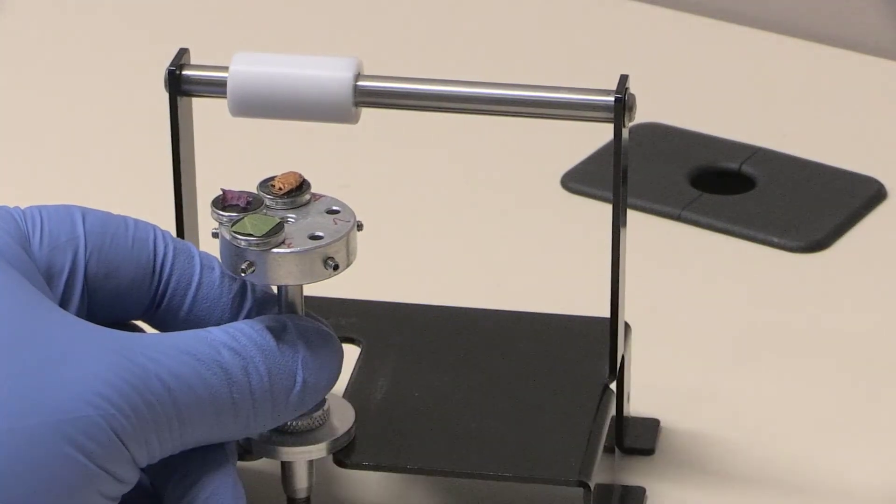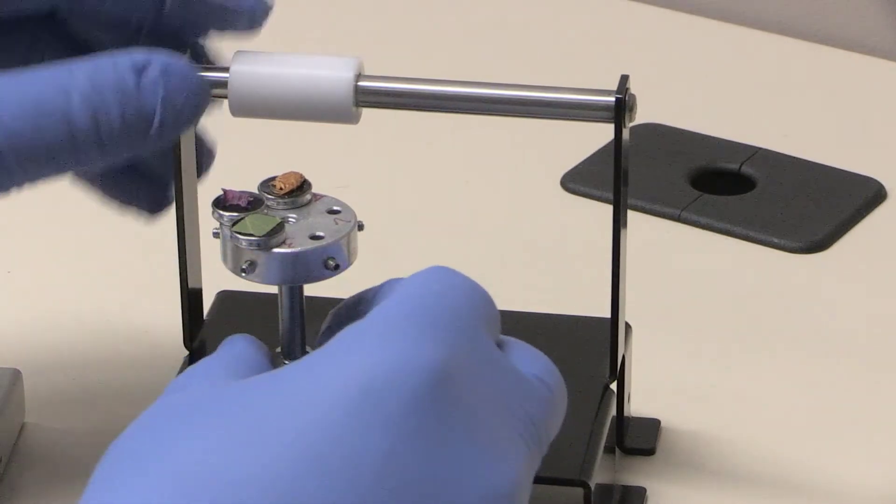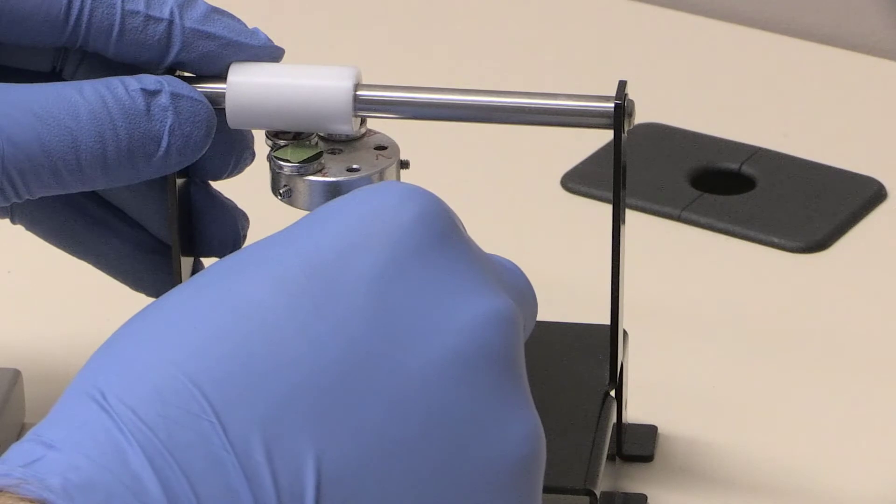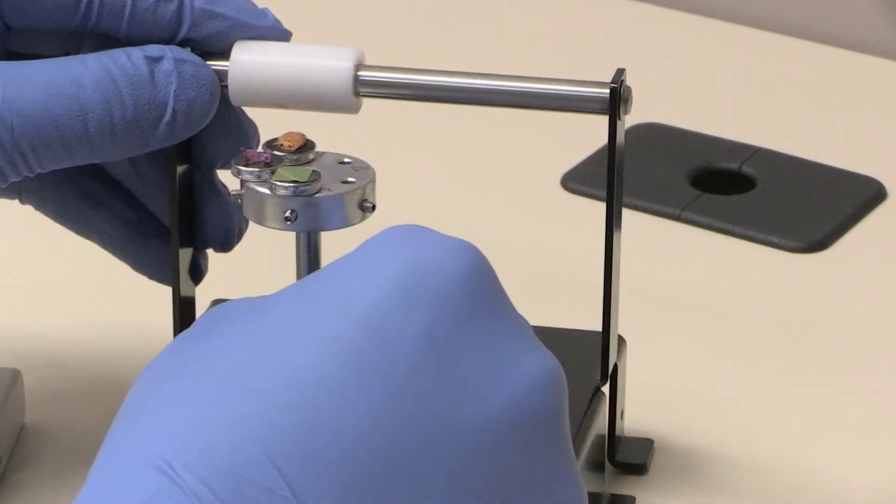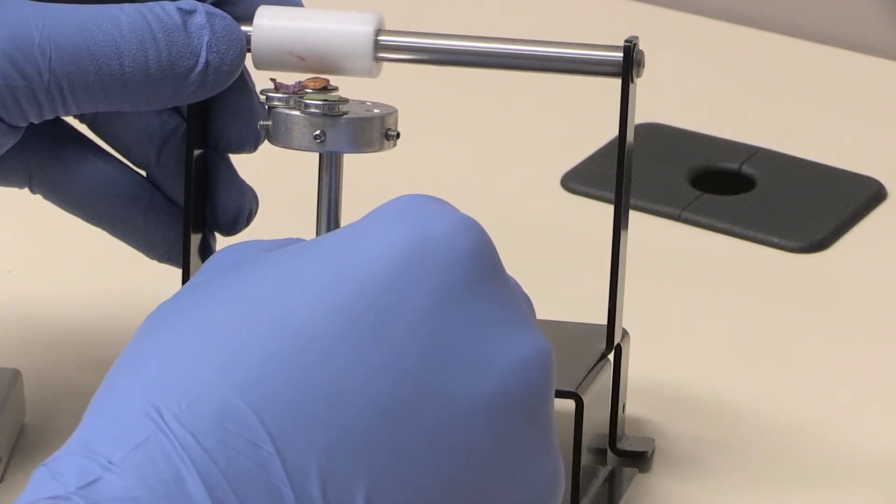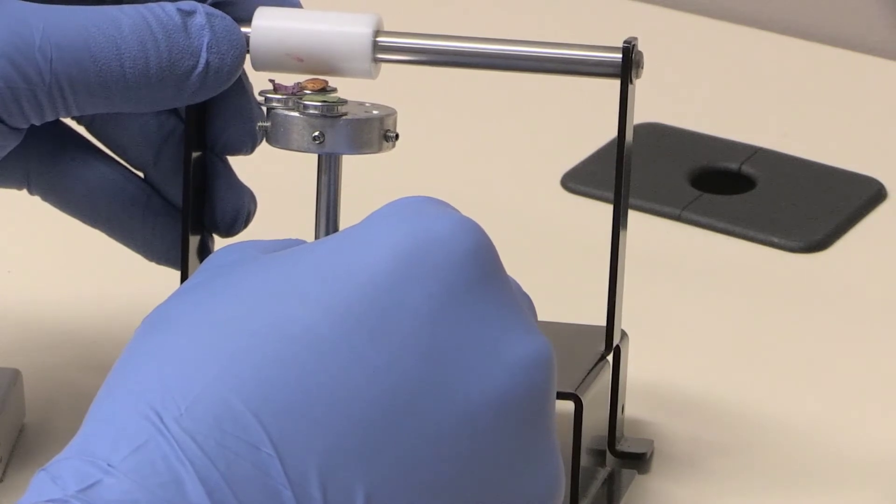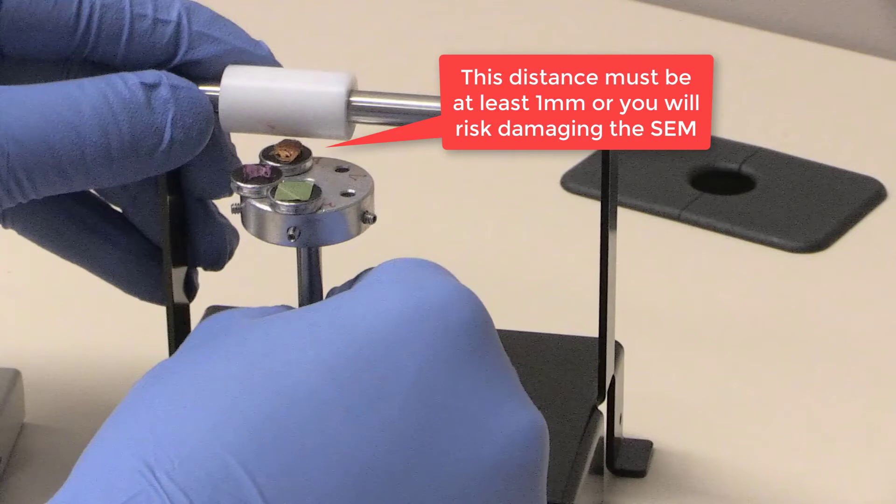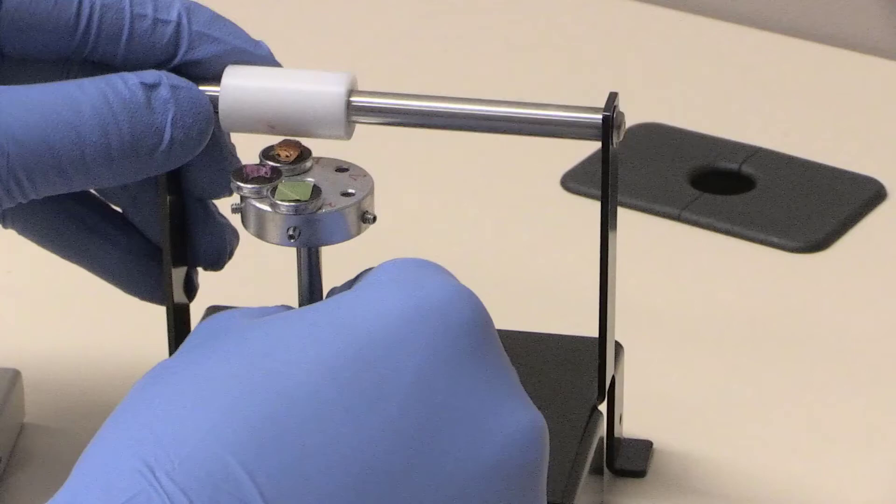When all of your specimens are secure, place the specimen stub in the calibration device. Make sure all of your mounted specimens barely pass under the white roller. There should be about one millimeter of clearance. This is a crucial step to ensure your specimens are close enough to get a good image, but far enough away that they won't scratch the delicate instrumentation inside the SEM.